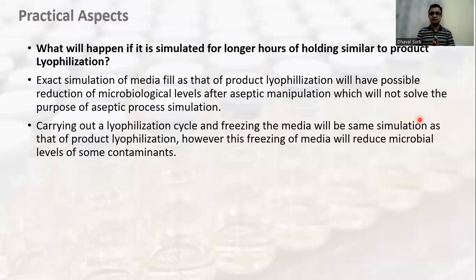However, this freezing of media will reduce the microbial level of some contaminants. If we are freezing the media, then it will not support the growth of microbes as it does at normal room temperature or ambient temperature.